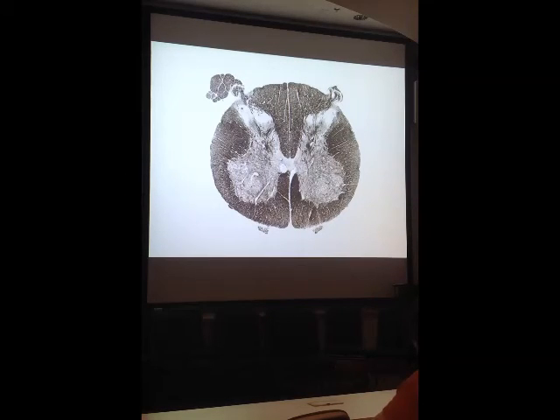Primary sensory neurons. The cell bodies of these axons, remember, are out in a DRG somewhere down below this level. Because these fibers are primary sensory fibers carrying fine touch, vibration and proprioception from the ipsilateral lower part of the body.